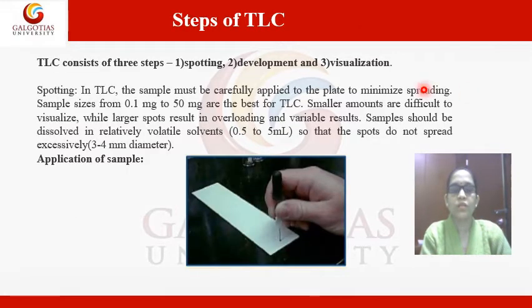Then what are the steps of TLC? TLC consists of 3 steps. One is spotting, another is development, and the last one is visualization. So let us first discuss how we spot the compound on the TLC plate.